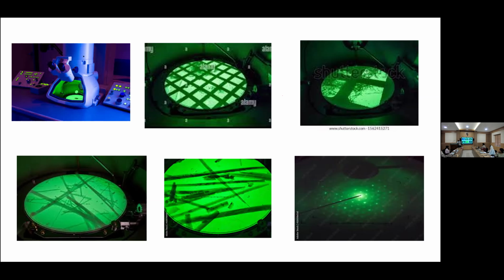Then we will just choose this region of interest. We see this like this. First we choose one region from this column. This is a 3 mm grid.